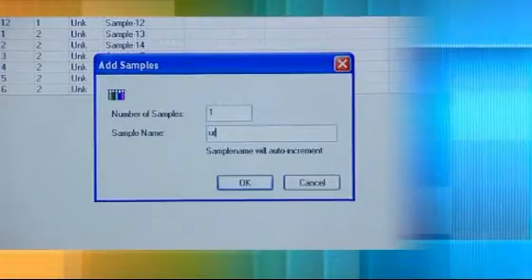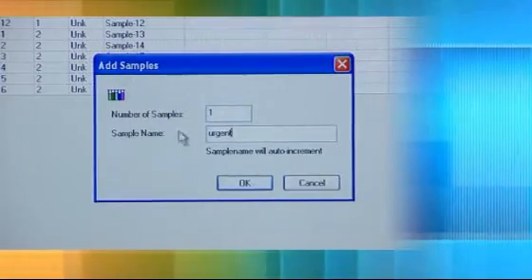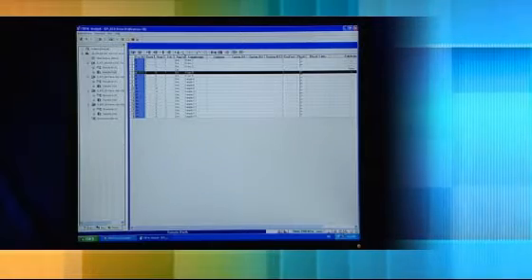This allows you to add, delete or edit sample information or change the running order of a sample or QC while the analysis is in progress.